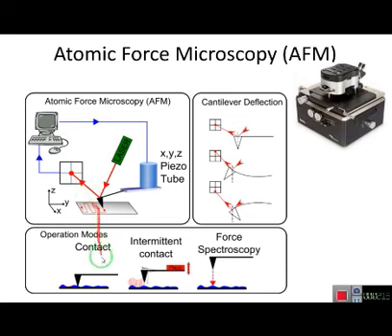Depending on whether the cantilever is going up or down, the light emitted here will also go up and down. So this is the basic concept behind the AFM.